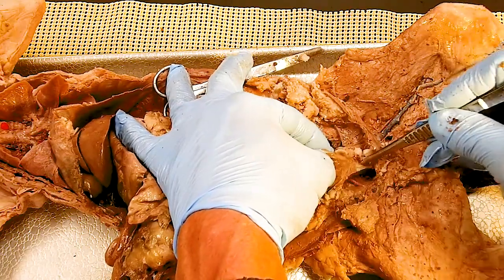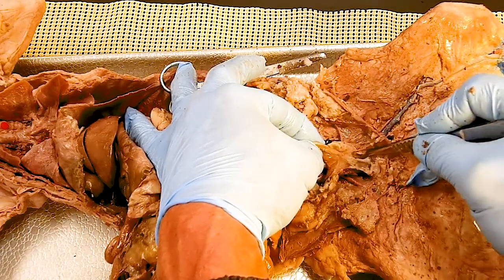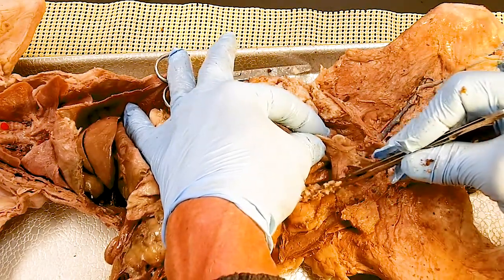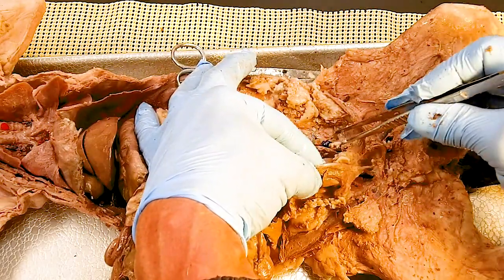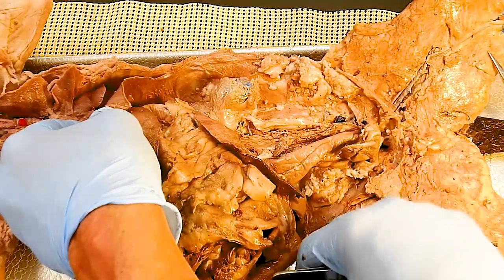And then the bladder is drained by the urethra. So I've just pulled the bladder up a little bit. You'll see the last or third tube right here. That little white tube coming out, that's the urethra. So you've got one urethra, two ureters, although one of them's kind of been cut off. There it is. Urethra, ureter, ureter, bladder, kidneys, and capsule. That's it for the renal system on the cat.